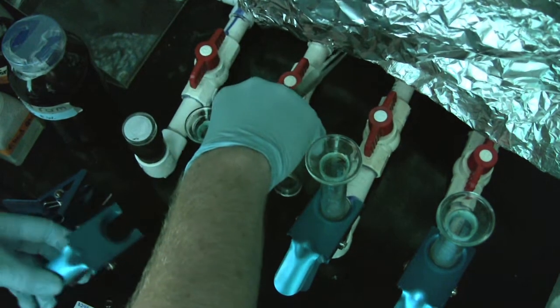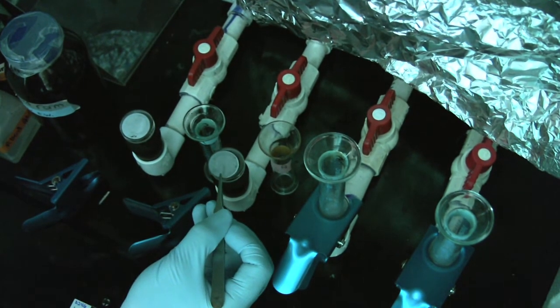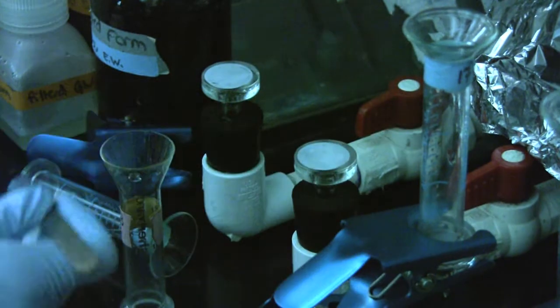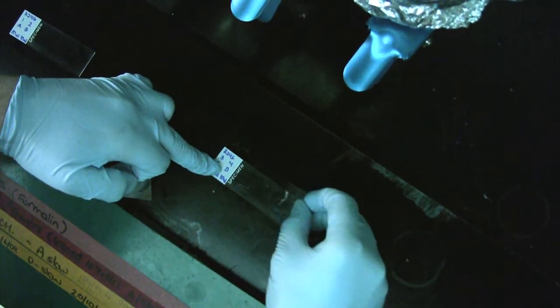Then we removed the filters from the suction apparatus, making sure not to flip them over because the bacteria is on one side, and placed them onto glass slides with oil. We put oil on first, then the filter, then added cover slips with more oil, and repeated that for each slide.